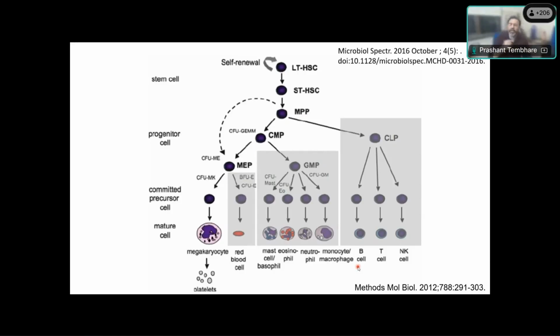So in flow cytometry language, the cell is called an event because one cell is going through the laser. It's a continuous, physical process. So when a cell comes through the laser and interrupts it, it's an event. That's why anything you note in flow cytometry is called an event. Each cell, meaning each event, is noted by the flow cytometer or even other instruments like a cell counter.